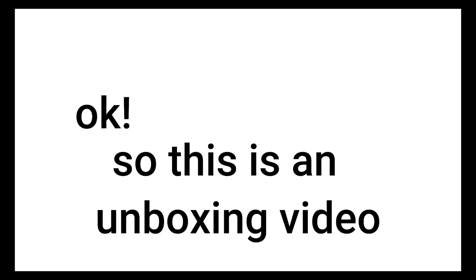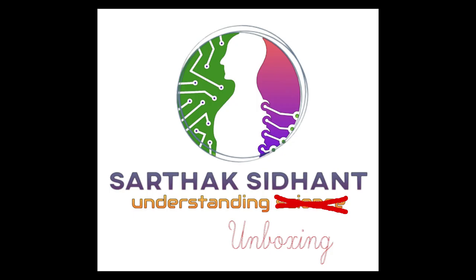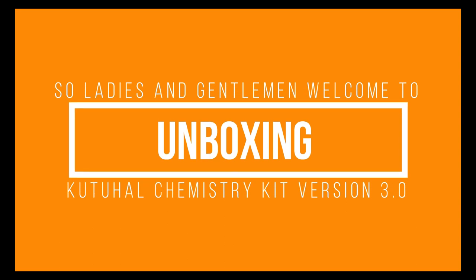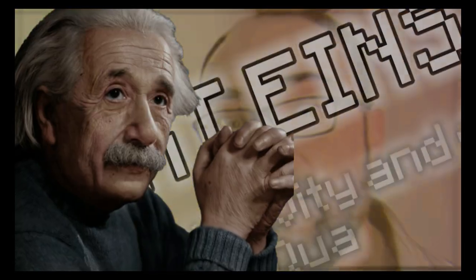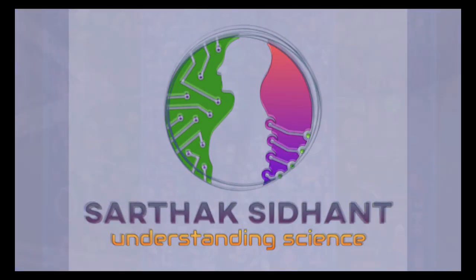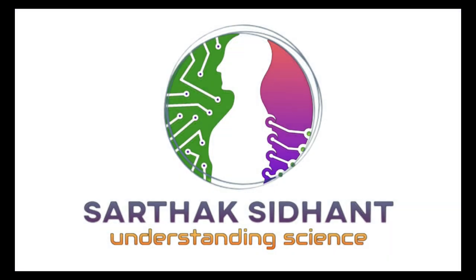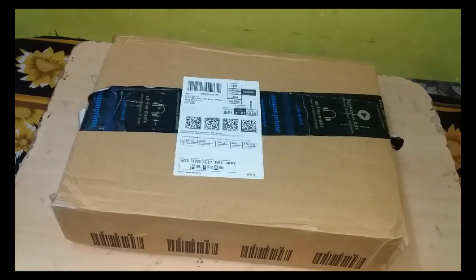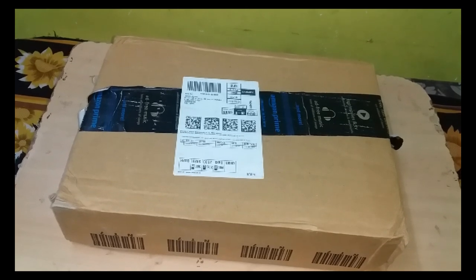Okay, so this is an unboxing video. Now Sarthak Siddhant is still a science channel, it's not some unboxing channel. So ladies and gentlemen, welcome to unboxing. You know what I wanted the most - a chemistry kit - and today it arrived from Amazon as a gift to me. So let's unbox it.